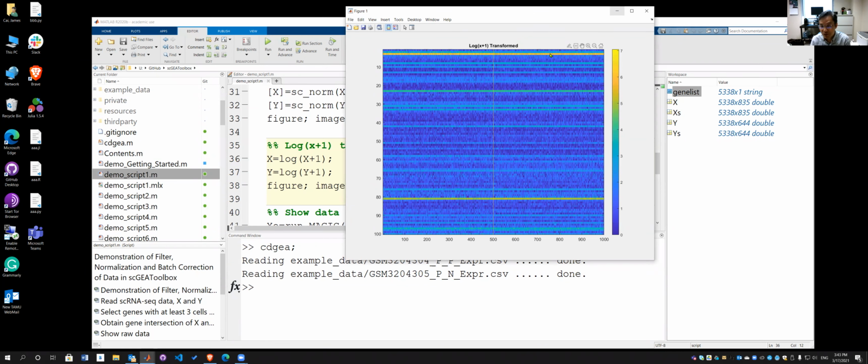And still you have gene number 3 with the highest expression level, in yellow, and number 81 is in second place. And you start to see this pattern.